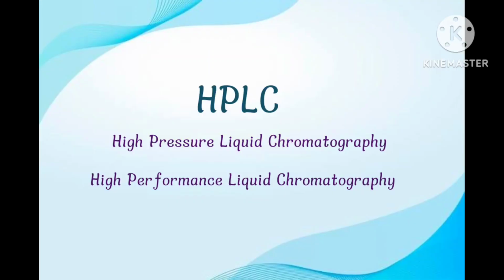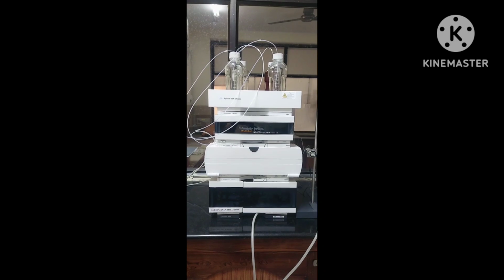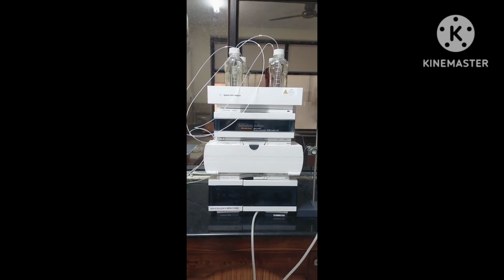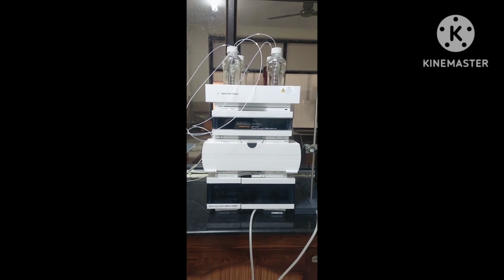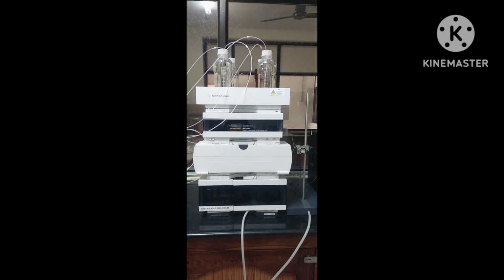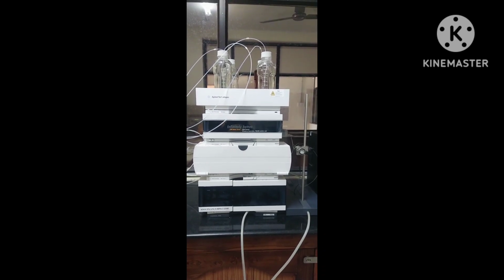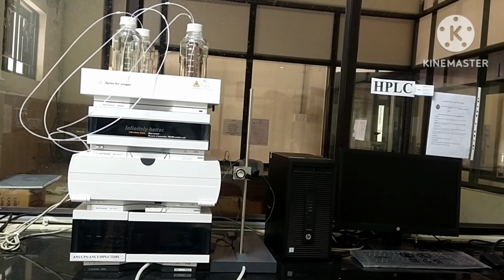Today we have a look at HPLC, High Performance Liquid Chromatography, also known as High Pressure Liquid Chromatography. HPLC is an analytical technique used to separate, identify and quantify specific components in mixtures. The mixtures can originate from foods, chemicals, pharmaceuticals, biological, environmental and agriculture. This is an Agilent 1260 Infinity quaternary liquid chromatography.